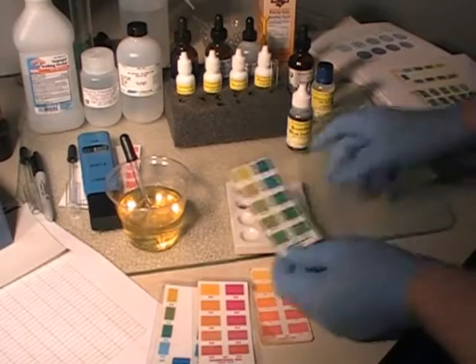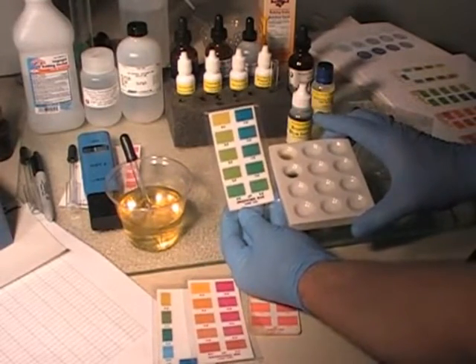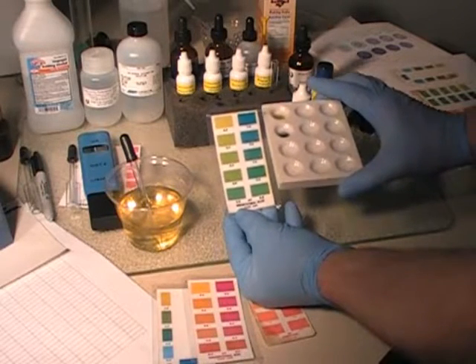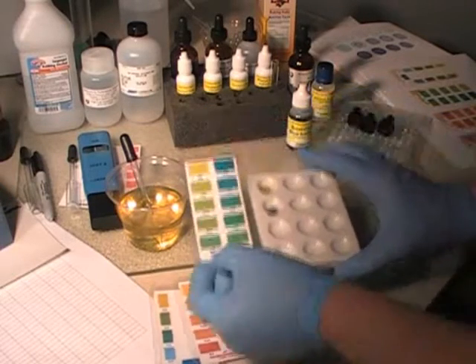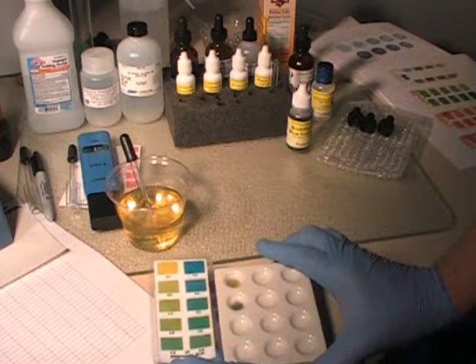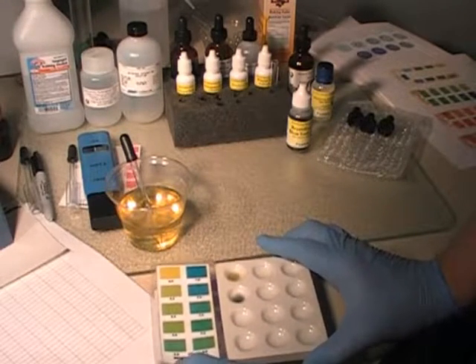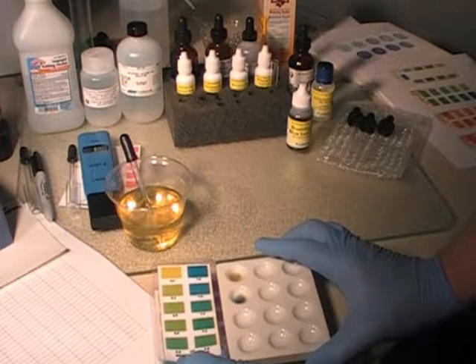However, we're now going to look at the other number, and what do we see here? Yeah, it's certainly not a blue. We can tell that. And when we bring it over here, I would say you're looking in the vicinity of a 7.2 to 7.3, somewhere in that area. Takes a little while to get used to this.